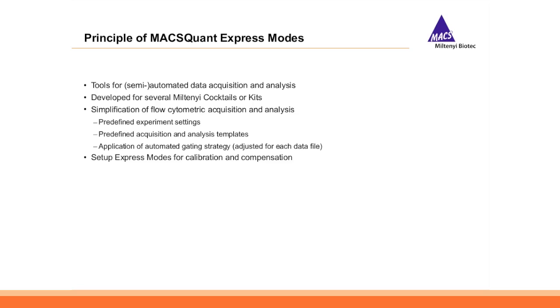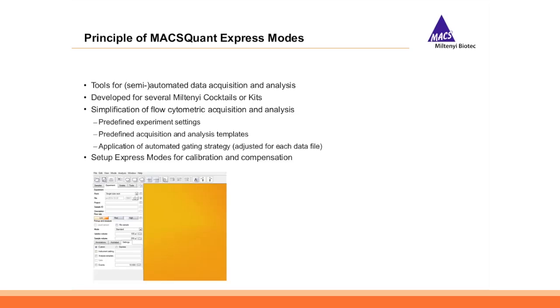If you already have a MACSQuant analyzer, you have perhaps already used an express mode, or for example, you have used one of our setup express modes like the calibration or our compensation multicolor. Where do you find our express modes?